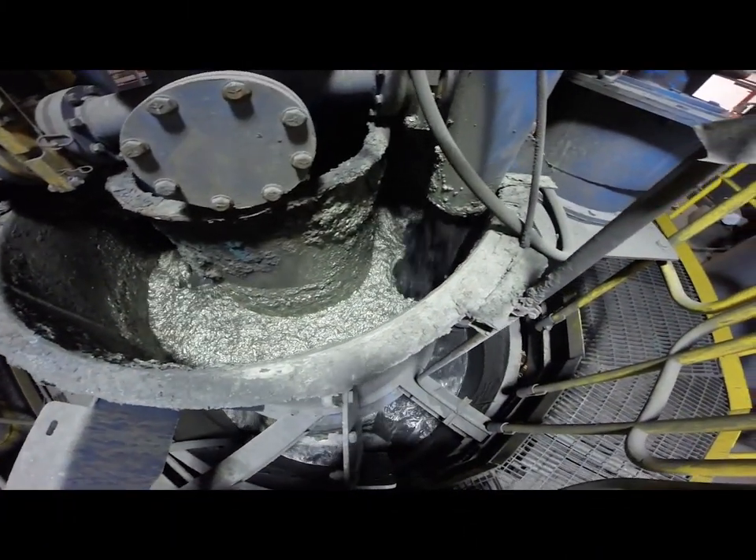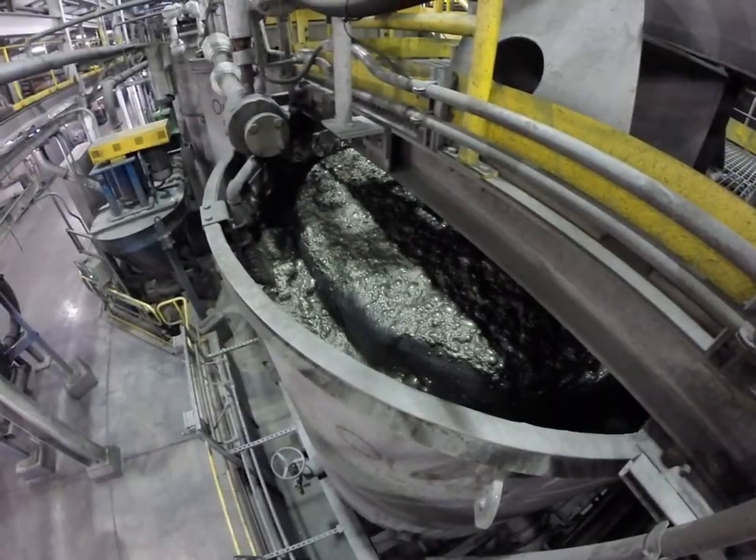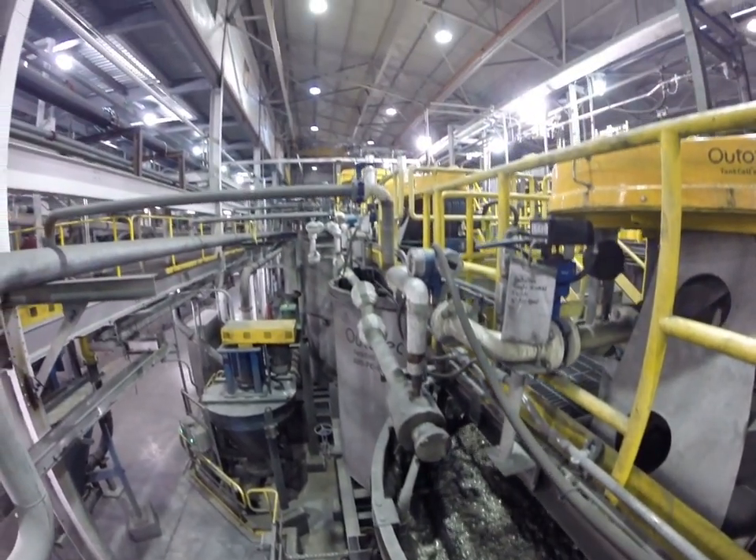Today we are running float tests. Float testing is done to help us understand what's going on in the mill as far as the amounts of reagents that we use and also the cost of the reagents.